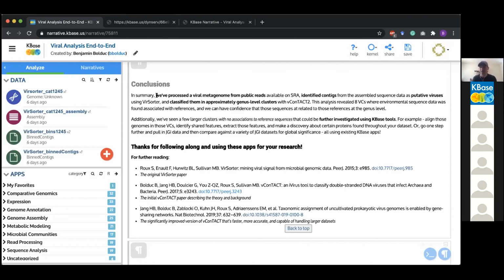And you can actually make a global story out of any one of the genomes or genes that you're interested in. So if a particular genome that you have has a major capsid protein, but also has a suspected AMG. In fact, there's a tool coming online on KBase. I'm still debating whether or not I should say the name. It basically identifies AMGs in microbial data. And you can actually use it to identify AMGs potentially in your viral data too.